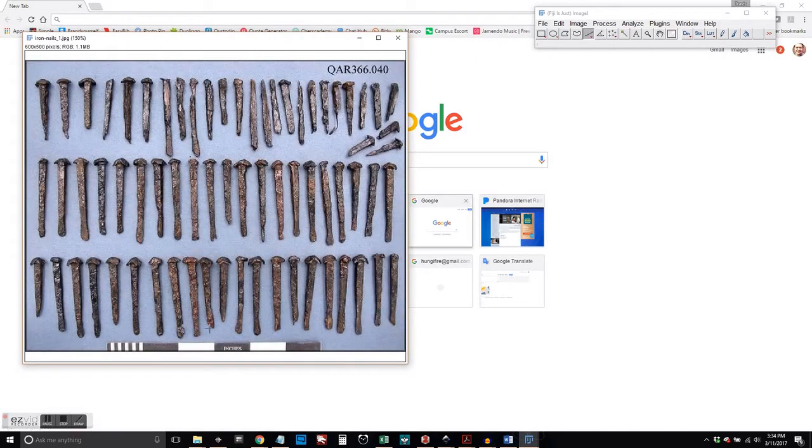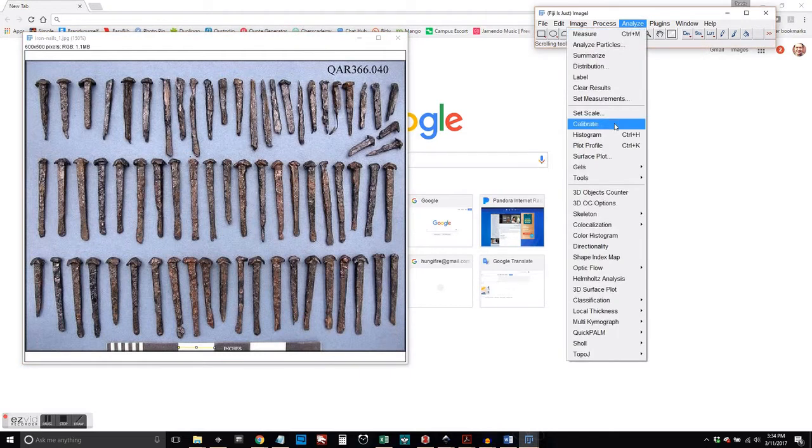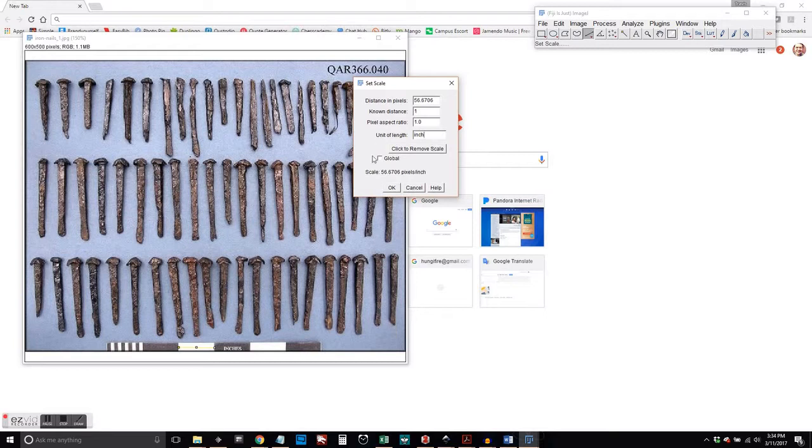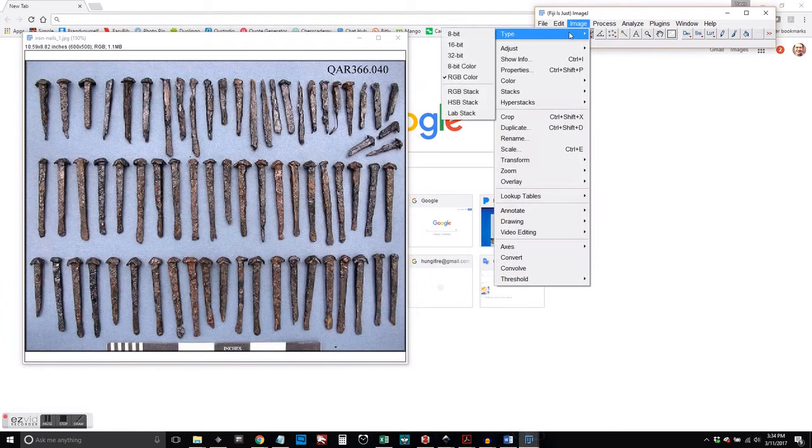And the first thing we're going to do is calibrate the image. You see we've got one inch down here. So we're going to make sure that ImageJ recognizes that that number of pixels is one inch. And that will help for our analysis later.